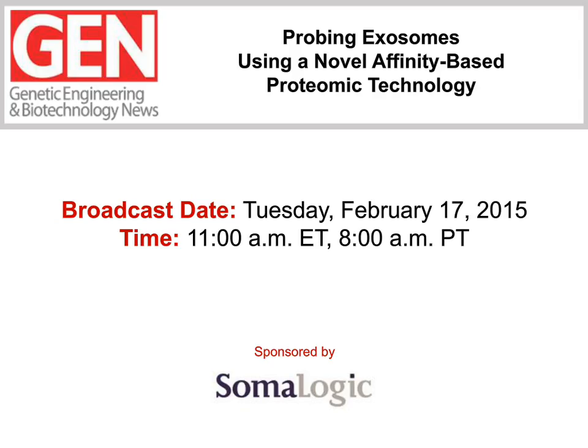It's entitled, Probing Exosomes Using a Novel Affinity-Based Proteomic Technology. Exosomes were once considered cellular garbage bags. Now these lipid nanovesicles are being explored for a number of applications, including their use as drug delivery vehicles and as research tools. Today's webinar will show you how exosomes are now being moved into the clinical diagnostics arena by a new affinity-based proteomic technology. You'll also learn how research teams are applying this technique to answer disease-specific proteomic questions in a high-throughput environment.